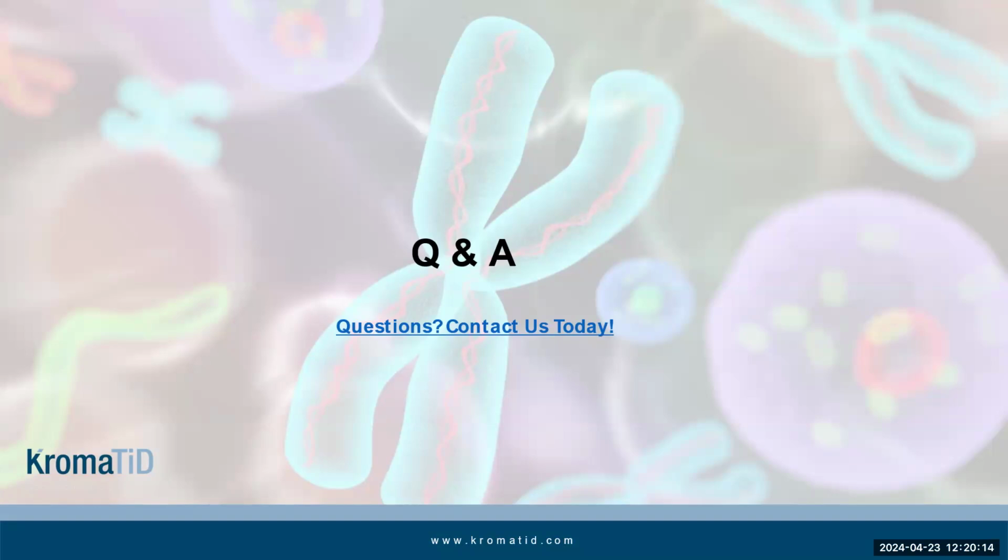So can you explain a bit more about the analog that is incorporated and how that works? So these are nucleotides that are added to the culture medium that are going to make the daughter strand more susceptible to UV irradiation later on in the processing step. It is added specifically to increase that vulnerability and cause nicks in those daughter strands so that subsequent exposure to exonuclease can degrade them, leaving only the parent strands, so you can get the DGH outcome.